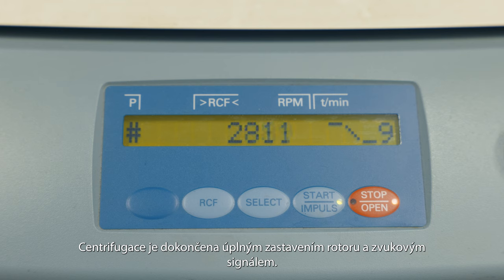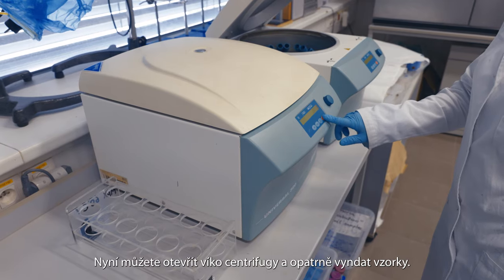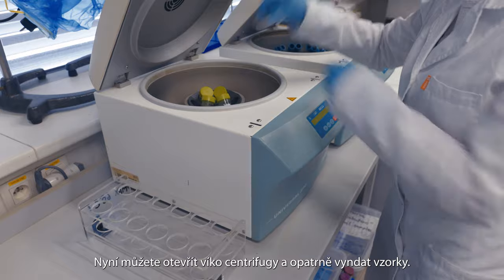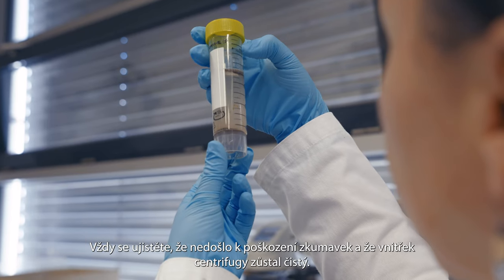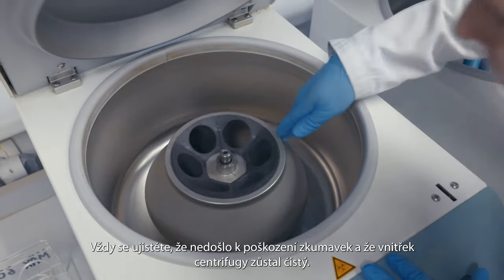Centrifugation is finished with a complete rotor stop and an audio signal. You can now open the centrifuge cap and carefully remove the samples. Avoid moving quickly or shaking the samples. Always make sure that the tubes have not been damaged and that the inside of the centrifuge remains clean.